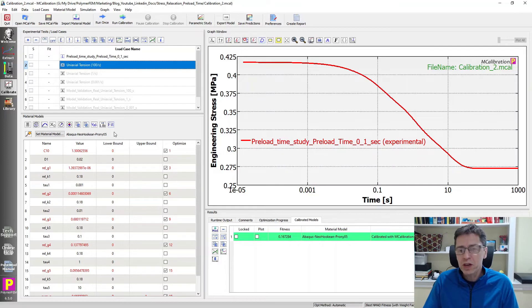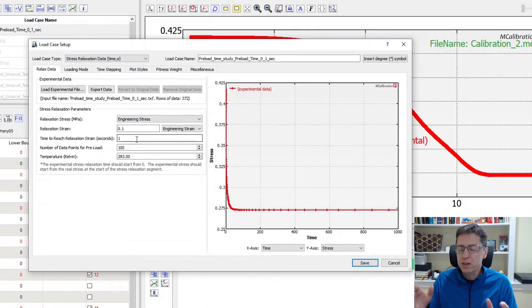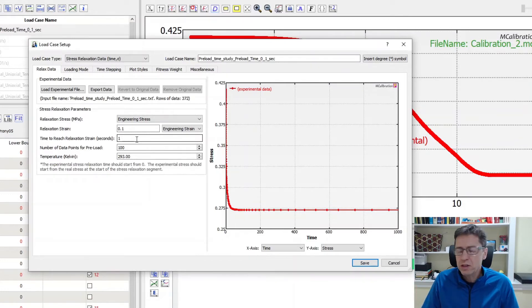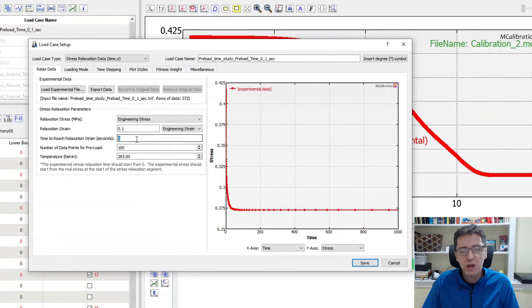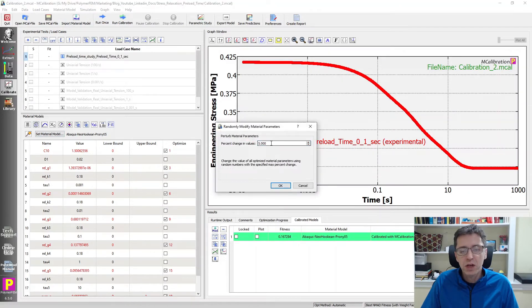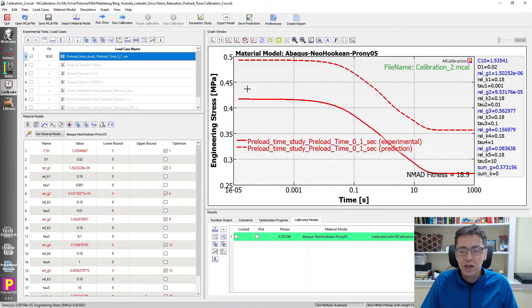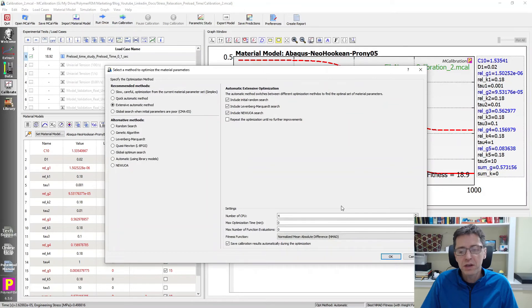Let's try something new. I'm going to use the same experimental data that we know how it was generated, but change the way we interpret it. We're going to pretend we didn't know that this particular stress relaxation test was loaded in 0.1 seconds. We'll assume it took one second to load it to the strain at which we started the stress relaxation test. So in MCalibration, the time to reach the target strain is specified as one second, which is not what it was. Let's see how much that influences the results.